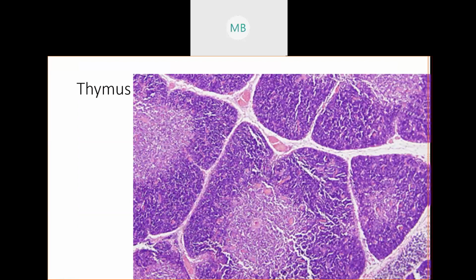Right, the next gland you guys have down on your list is called the thymus. The thymus is pretty interesting as far as cells in histology go. And your thymus, when looking at it under microscope slides, can be either pink-purple or it could be a reddish color. It just depends upon the dye that was used. So don't let the color trip you up on this one. What's more important for this is you have to know the parts.